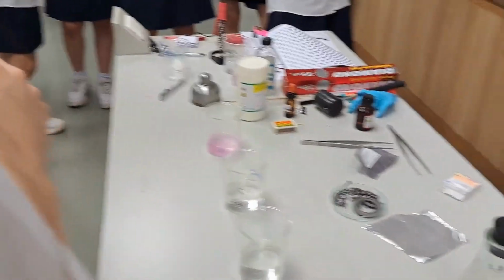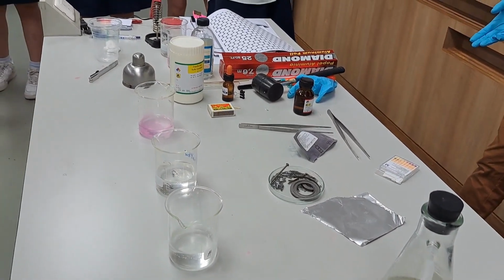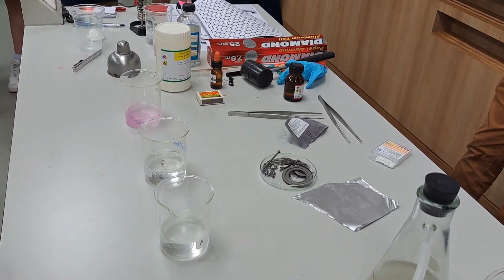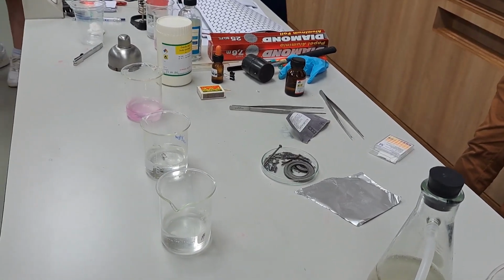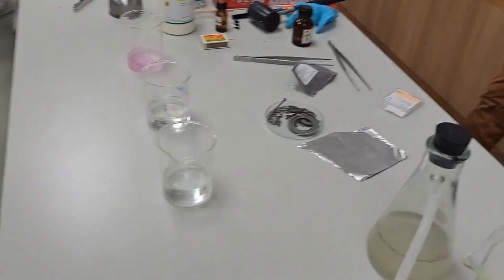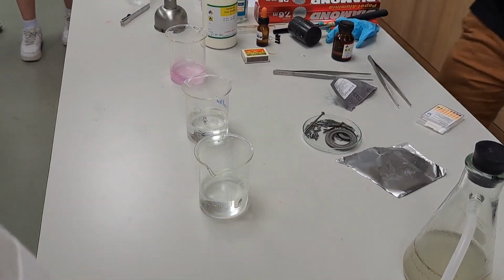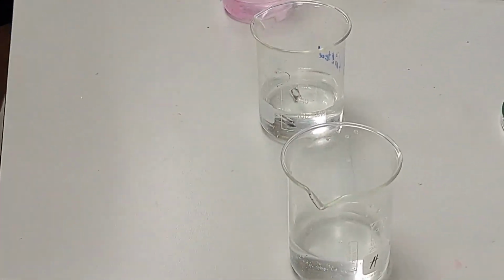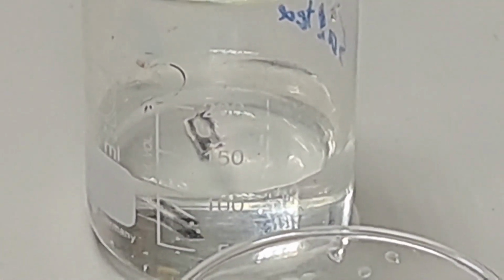Valence electron 1. So it tends to lose 1. But for group 2, they have to lose 2. So that's more energy, right? More time to lose 2. So that's why group 1 is more reactive. So let's wait and see before we leave the class how reactive they are. Right, this is group 2.